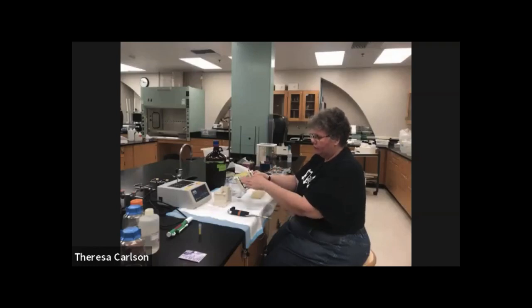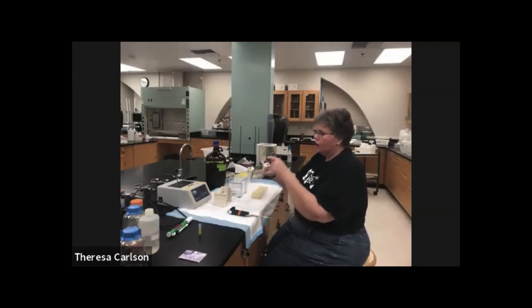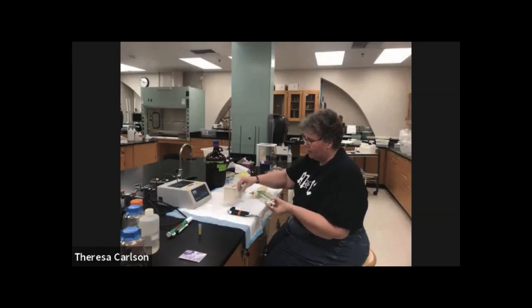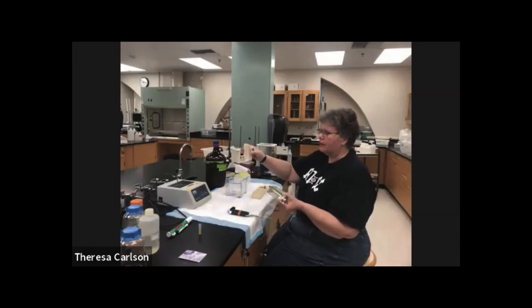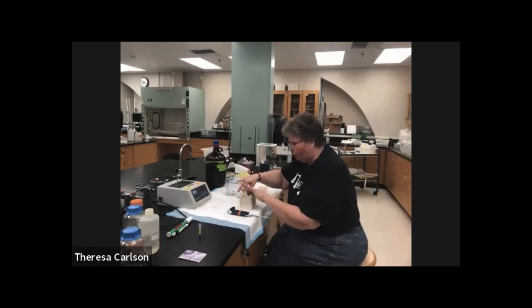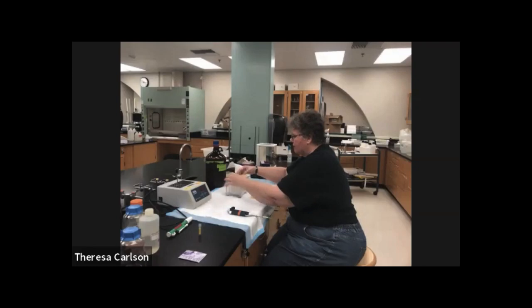Then on the other side, you need to have something blocking any buffer from leaving the inside. So we just have a piece of plastic that blocks and keeps buffer inside. You can run a gel on both sides, or if you only have one gel to run, that's when you use that piece of plastic. So then it's gonna go into the clamp assembly that holds it together. It slides right down inside, all the way down, and then you close the doors on it, just like that. This goes inside of our gel running box right here.